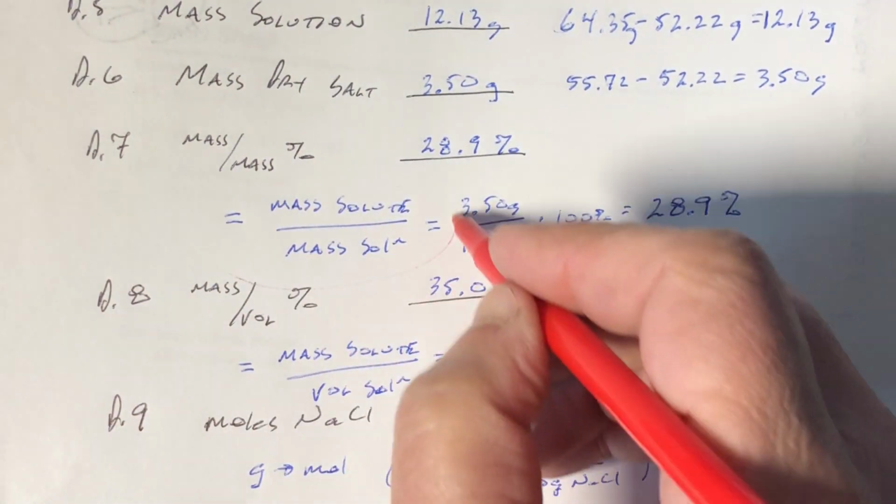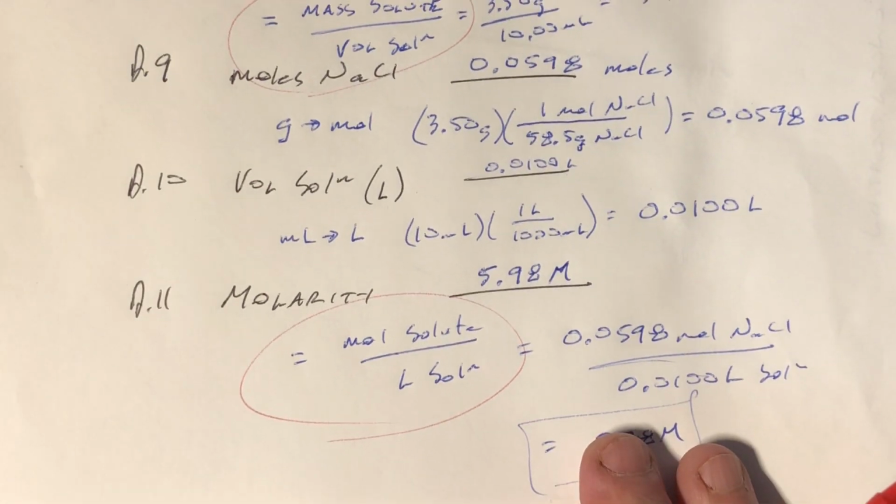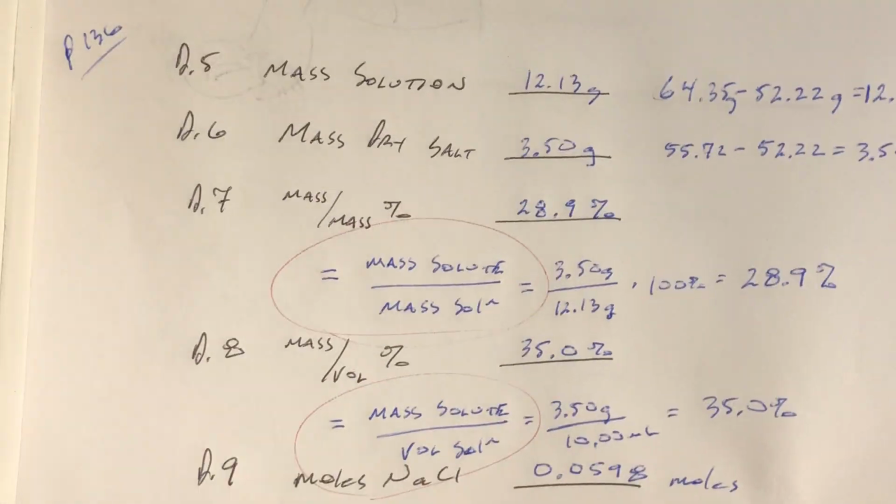All right, so again, what's key on all these things is pay attention to writing the units down everywhere, and be absolutely sure every chance you get you write down definitions of any of the terms that are somewhat unique to chemistry before you press on.